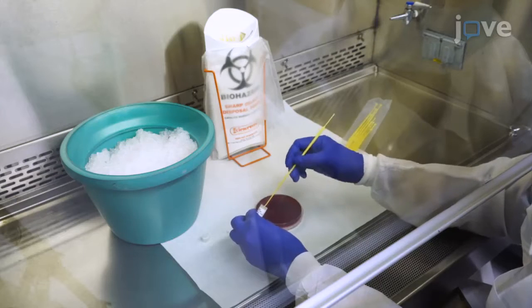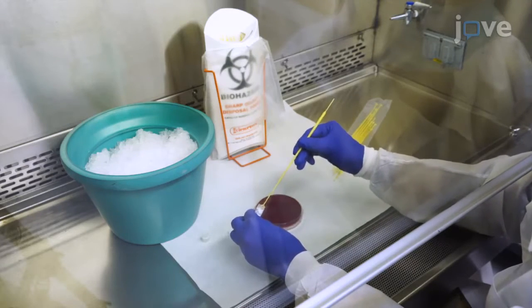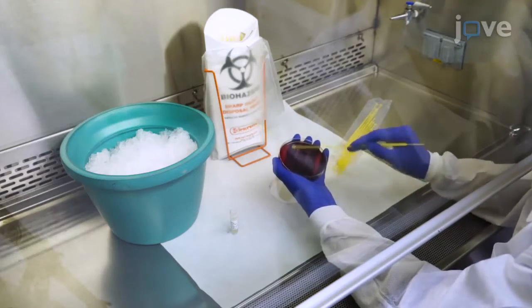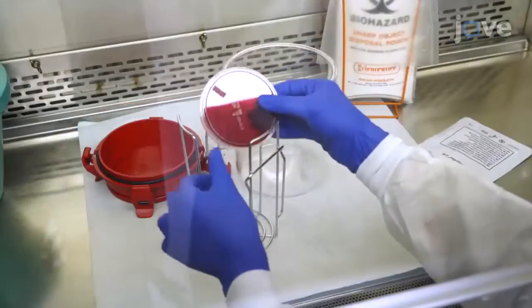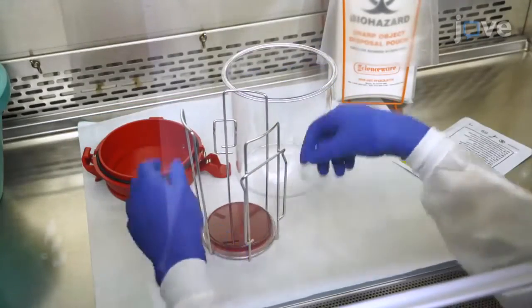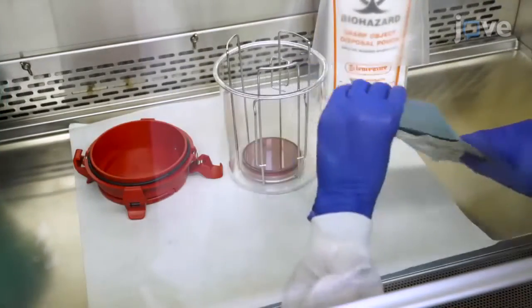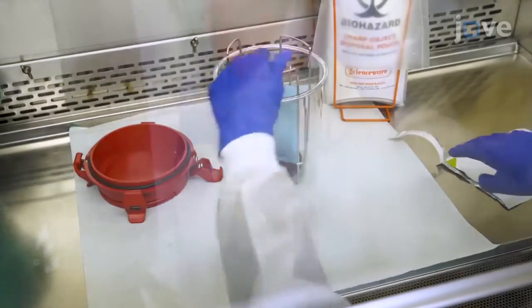Using sterile technique, streak a rehydrated or thawed bacterial stock onto a campylobacter-specific agar plate, and place the plate at 37 degrees Celsius for 48 hours in an anaerobic jar containing a microaerobic atmosphere gas-generating sachet.